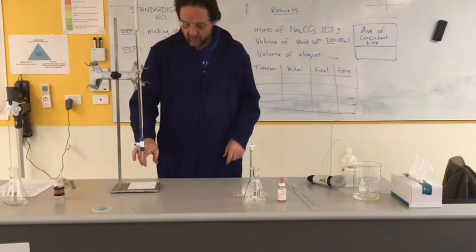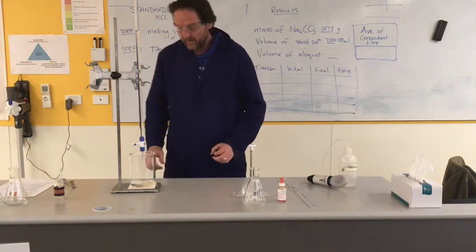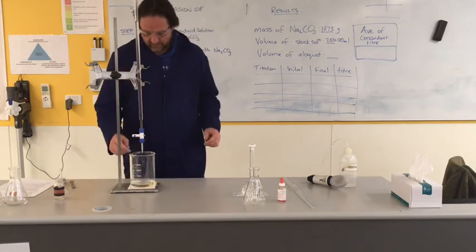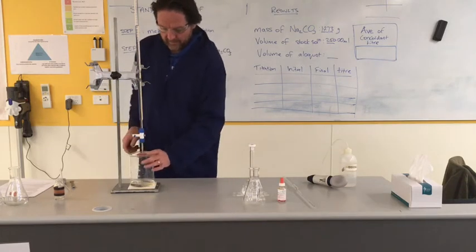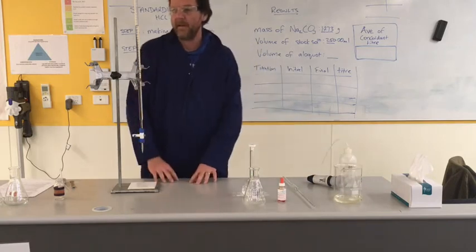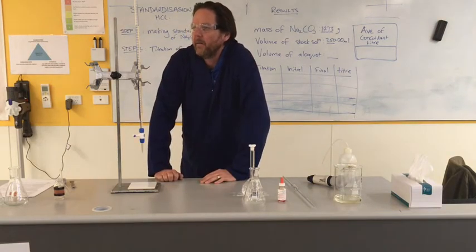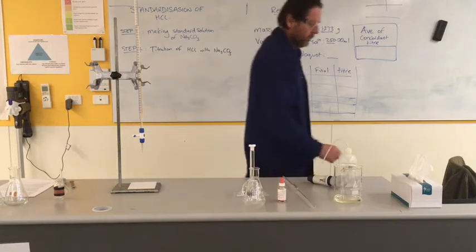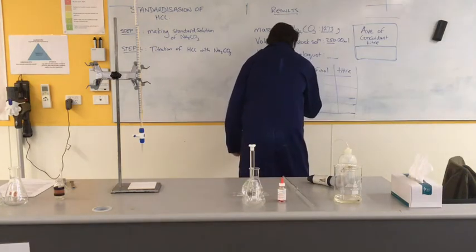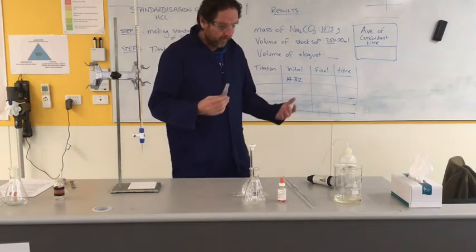Now I want to make sure the tip is full and has absolutely no air bubbles in it - just flick it like you might have seen people on TV flick hypodermic needles. A couple of little bubbles have gone. So I'm going to write down at this stage my very first initial reading for titration number one, trying to get that to two decimal places. That is 14.32.